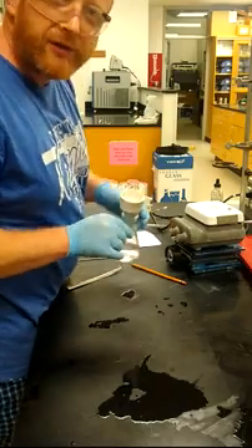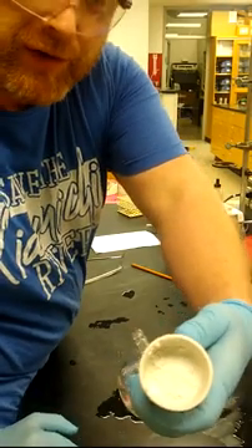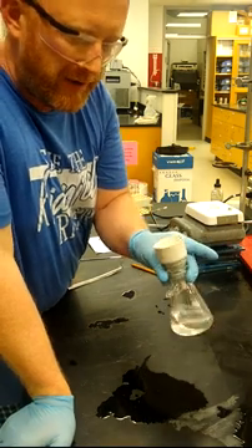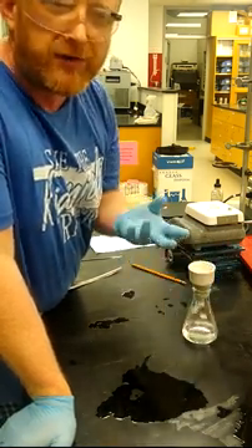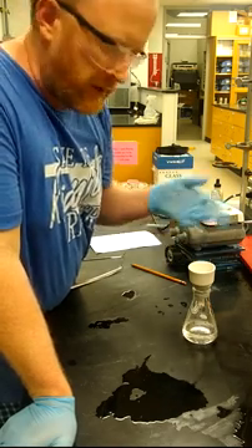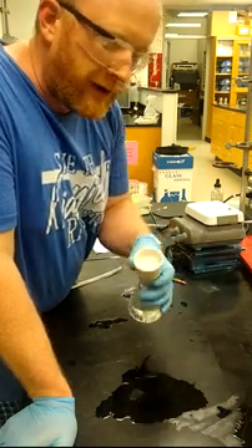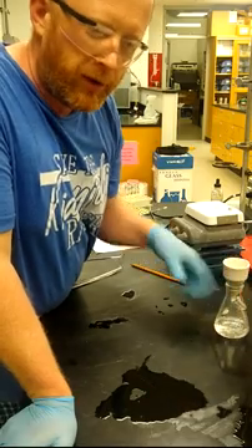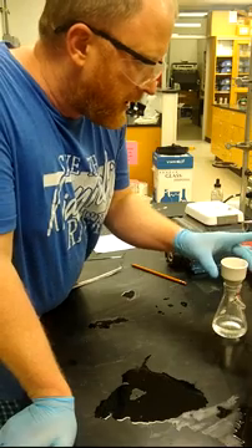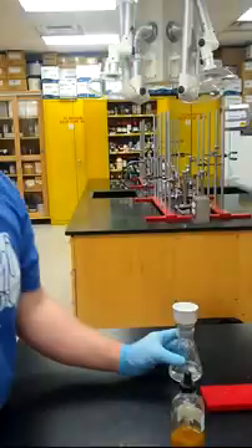After the suction filtration, right now I've got something that looks kind of like this — it's still kind of wet and clumpy. It would take a decent amount of time on vacuum to get a really dry solid for your accurate mass and melting point. But I'm just going to use the kind of wet stuff to do our qualitative test: the iron chloride test for phenols. After this, you would want to leave it on vacuum a while to make sure it's dry.